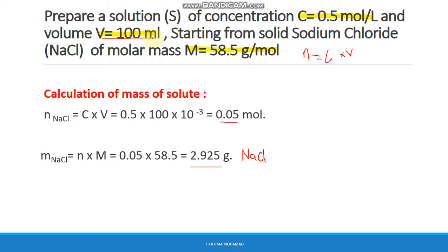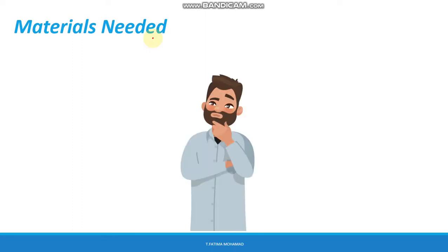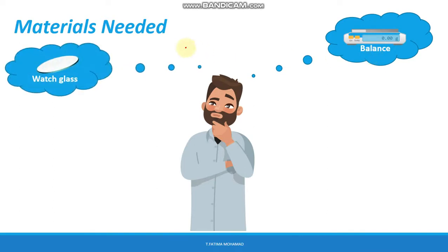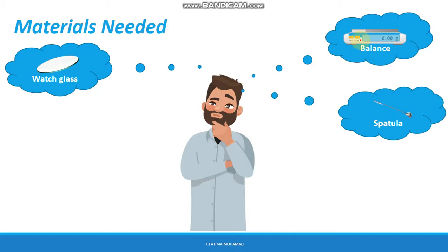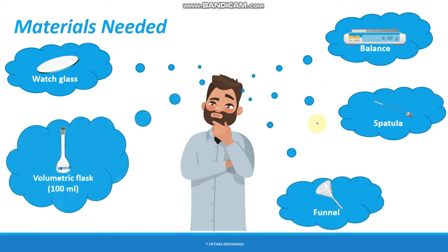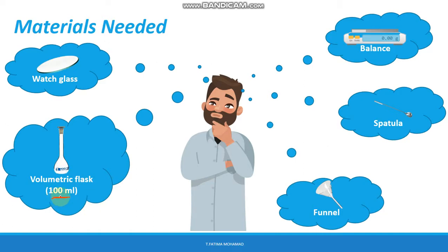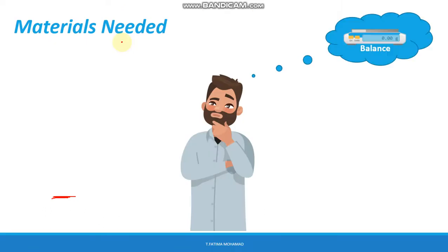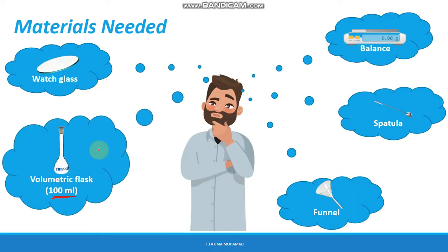Now, how do we do this? First, we need to know the materials required. You will use a balance to weigh the amount of solute, a watch glass to weigh on, a spatula to take the NaCl from the commercial bottle, a funnel, and finally a volumetric flask of 100 mL. We choose a 100 mL volumetric flask because the volume of the solution is 100 mL — the capacity of the volumetric flask always equals the volume of the solution.